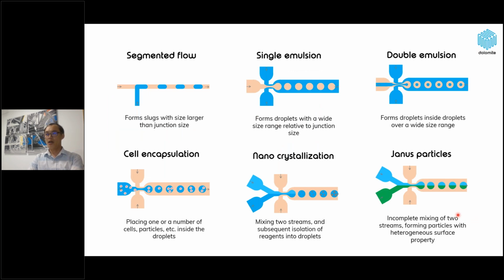We have many ways to make droplets or particles by using the microfluidic method.